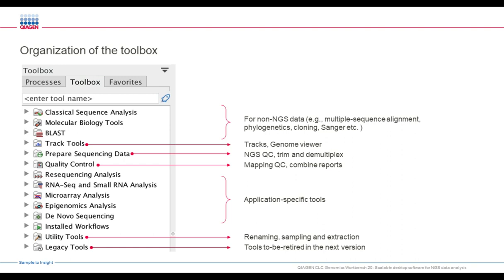Then you have resequencing analysis, RNA-seq and small RNA, microRNA, epigenomics, and installed workflows. These application-specific tools are populated when you download the workbench and also when you download specific plugins. Utility tools allow you to process objects in the workbench — you can rename, sample reads, extract reads from certain areas in your genome browser, and so on. Legacy tools are tools that will be retired in the next version, just to give fair warning.